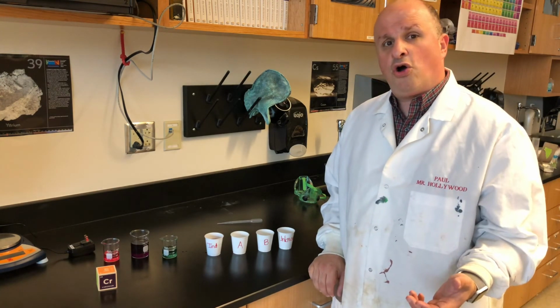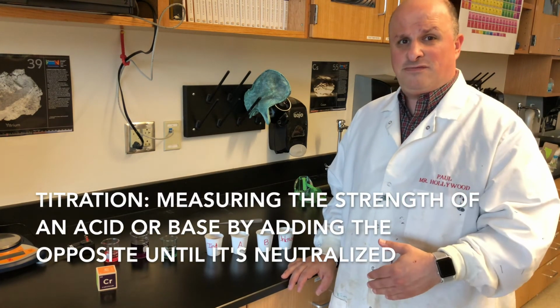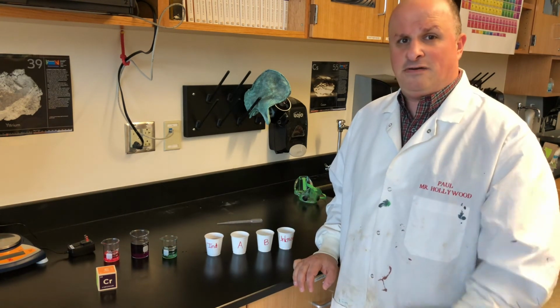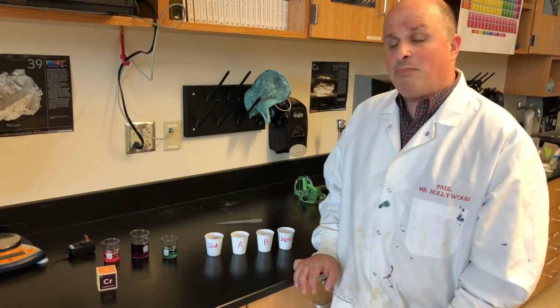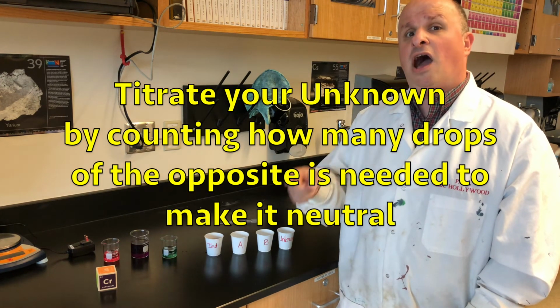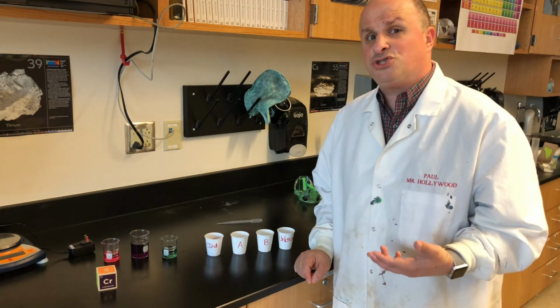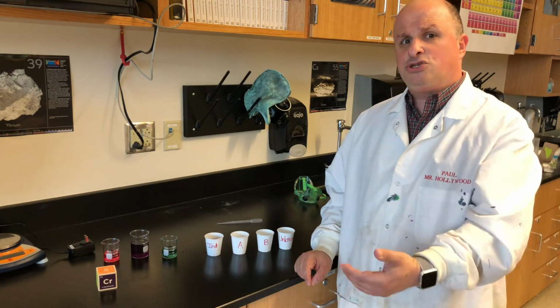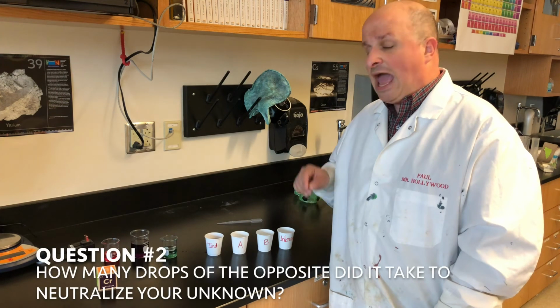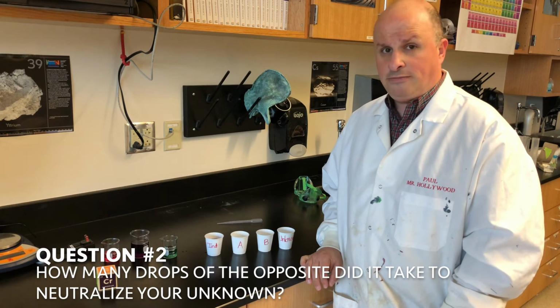The next thing we're going to do is called a titration. If the unknown is an acid, we're going to add the opposite of an acid, which is a base. And if the unknown is a base, we're going to add the opposite of the base, which is an acid, until we get it back to neutral, okay? So you're going to want to count how many drops of the opposite it took to get it back to neutral. And that's how we measure how strong an acid or a base is: how many drops of the opposite it takes to get it back to neutral. So question 2 that you have to answer in your notebook is, how many drops of the opposite did it take to neutralize your unknown, okay?